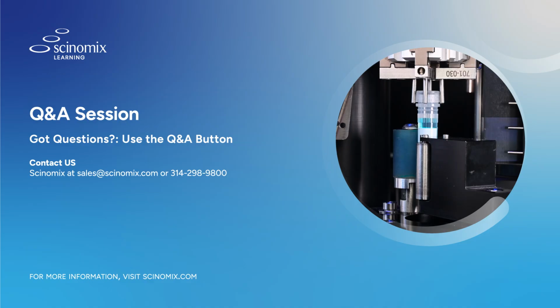Yeah, good question. So that's normal speed. At the very start, it has to pick up pipette tips and do liquid level detection, so it starts off slower than it would be running throughout your process. Again, we can balance throughput and accuracy needs. If we need higher accuracy, that may be a detriment to your throughput. And if you need higher throughput and accuracy doesn't necessarily need to be within 3.2%, but within 5 or 10, we can speed up the throughput and maybe get rid of those tip touches and things like that. So that is the normal speed for what we have set up, but you can really speed up the system based on your workflow and your needs.